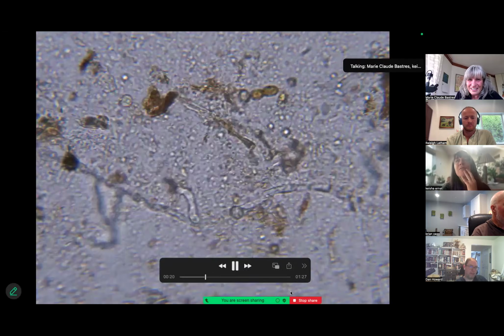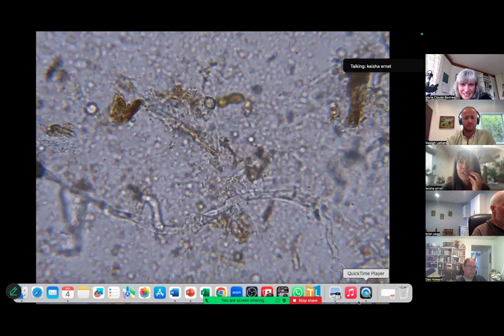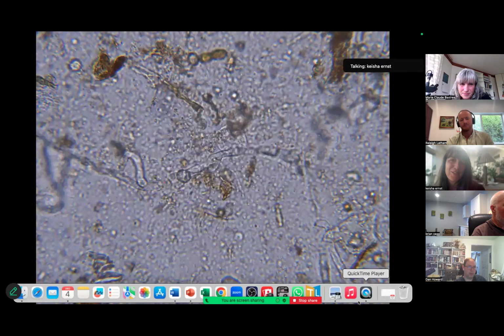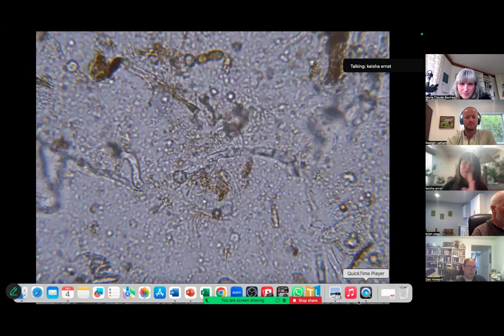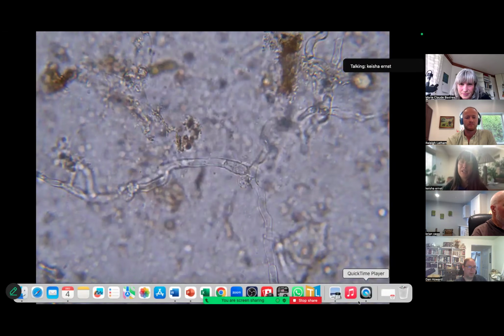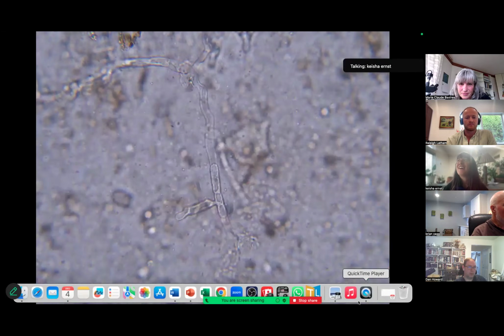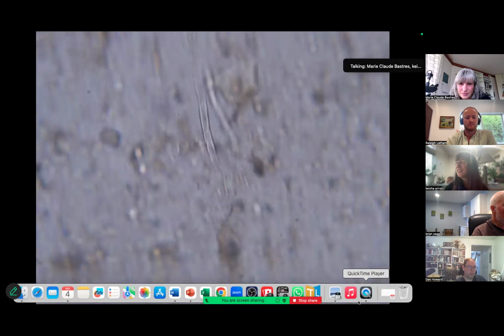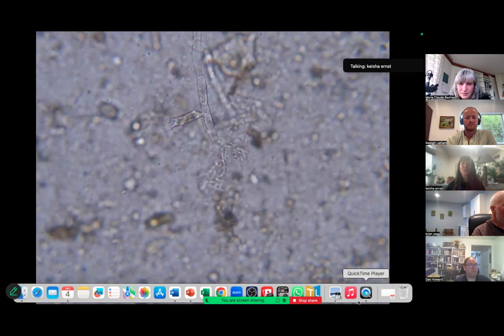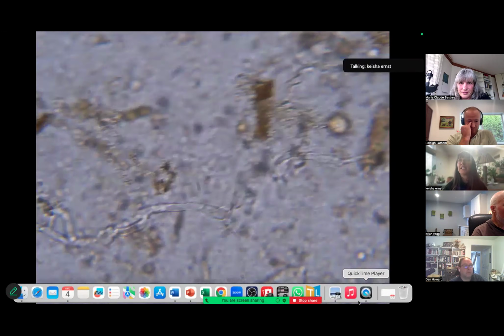It's interesting too. We use different species of fungi that we get from labs. Beauveria bassiana is one, and it's confirmed what it is. But if you look at its hyphal structure under a microscope, it looks very much like oomycetes, very, very much. There's a lot of issue with us feeling like we know so much. It's so important to keep curiosity and an open mind.